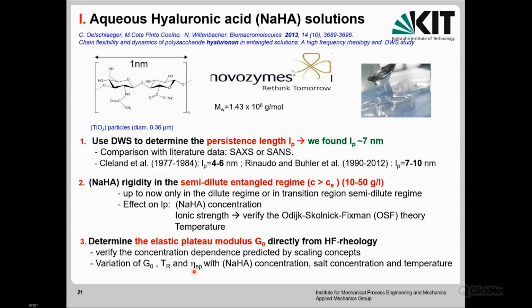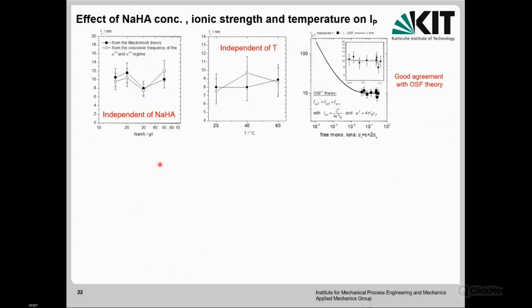So first, we have seen that the persistence length is independent of the hyaluronic acid concentration. The LP is also independent of temperature, and LP is also in good agreement with the theoretical prediction. You see here the line is what is predicted theoretically by the so-called OSF theory, and our points correspond quite well with the theoretical predictions.